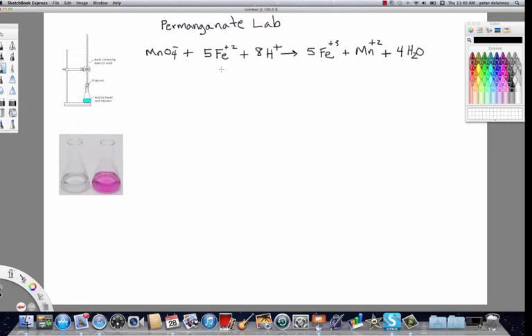Now, this is a process that requires essentially two steps. In the first step, we need to determine the analytical concentration of the permanganate solution. We're going to be using a solution that's approximately 0.02 molar, and I'm going to leave these two decimal places as unknown. So in the laboratory, I would dissolve enough potassium permanganate in water to produce a 0.02 molar solution.